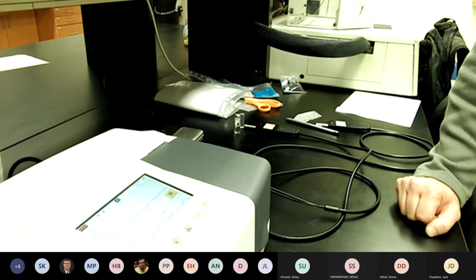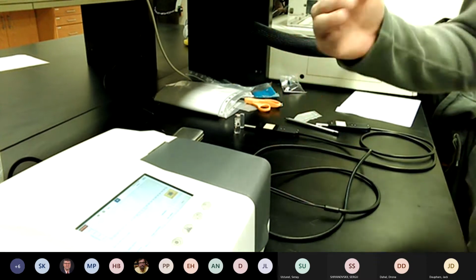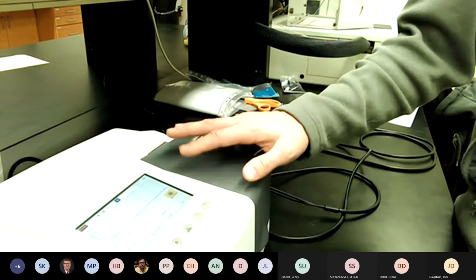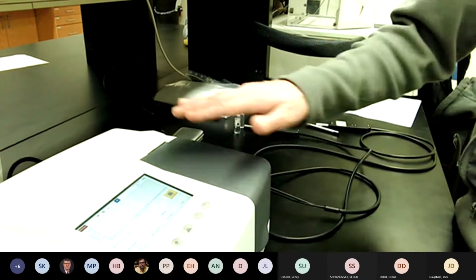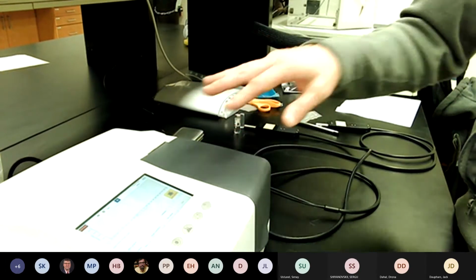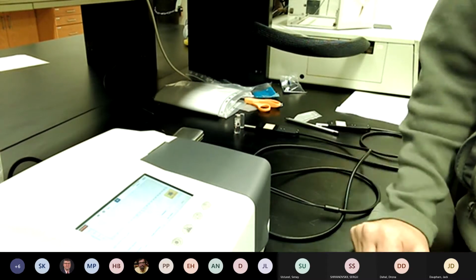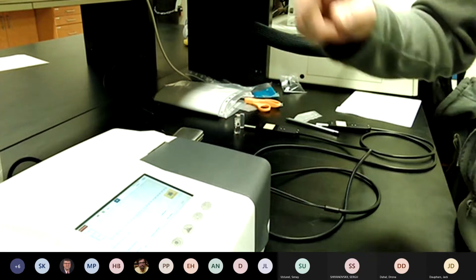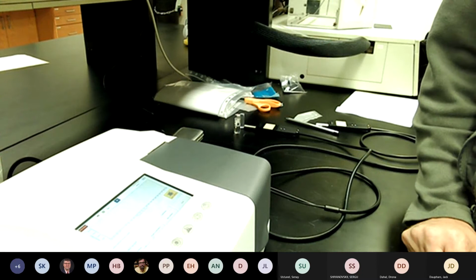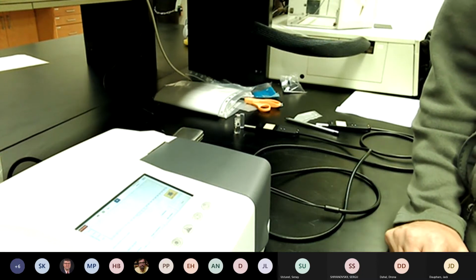You can see when you do an overlay from the library versus a sample that we did here on the benchtop, it's not going to be 100% because you'll see the background. When it was done in the instrument for the library, it was completely dark, so it sits nice and flat right on the baseline. When you have it out in the light, there's going to be a little bit of an elevation, so that alone is going to hurt some of that best fit. But if you look at the intensities of the peaks, you can see that they match up very well at the max, but you're just going to lose that on the baseline. So it's up to you how to optimize this and what you want to do with it.